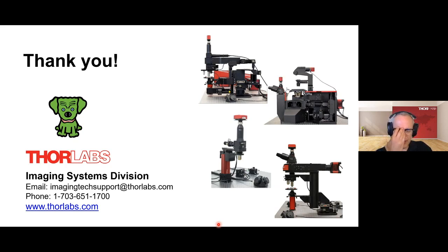So fluorescence microscopy is basically just talking about the fluorescent mechanism, a fluorophore getting excited by a photon and emitting a photon. That process underlies wide field, confocal, and multiphoton microscopy. We covered some of the differences between wide field and confocal in the talk. Essentially, confocal is laser scanning that uses a pinhole to exclude out of focus light, whereas wide field will use a traditional microscope with a camera. What was the last part of the question?